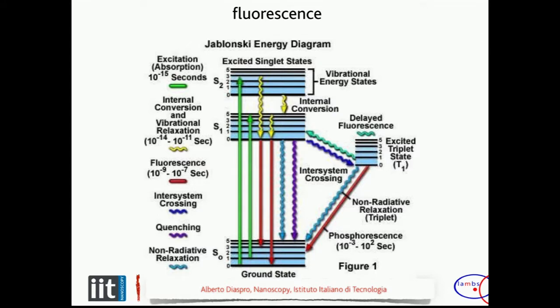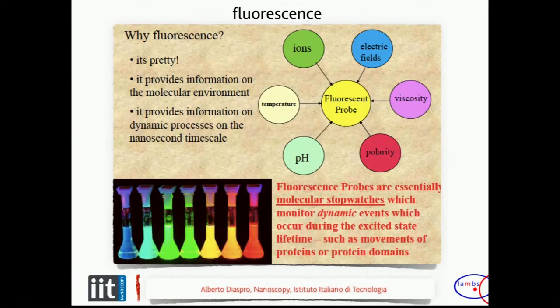Like when one is talking too much, you stop listening, but then you can get a coffee and start again. And with fluorescent molecules, after 40,000 cycles, for example, they stop emitting forever. Some of them can restart, but most of them stop forever. We will see about this property later.